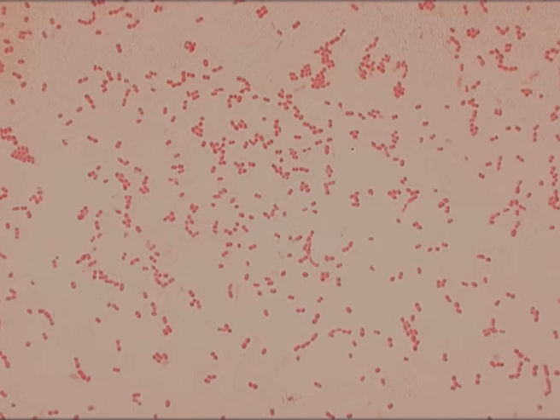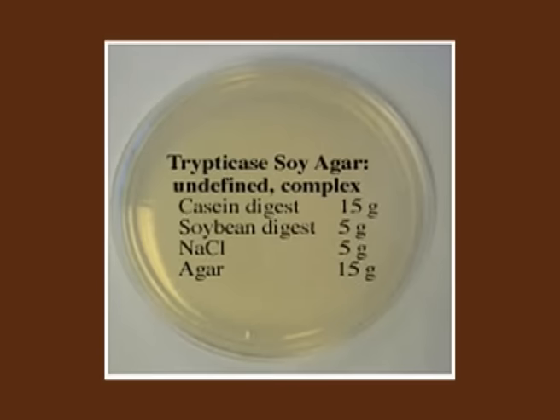The fastidious group of bacteria, which is more specific in its growth requirements, is grown in enriched medium. The second medium which falls under this classification is complex medium. Complex means, as the name suggests, the ingredients are not known precisely. These contain extracts from different plant and animal sources of undefined composition.